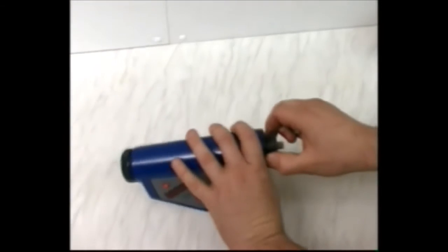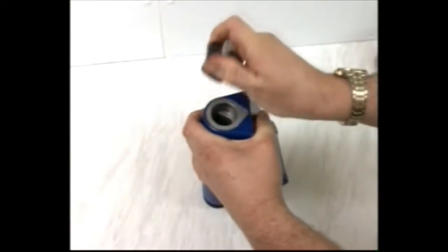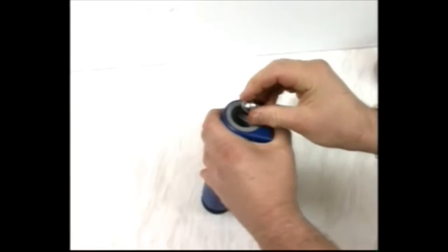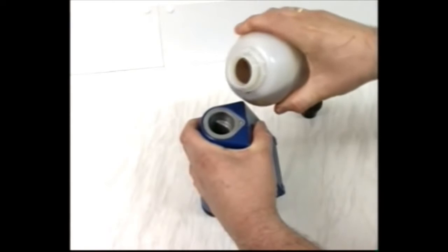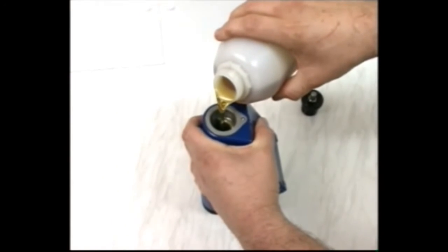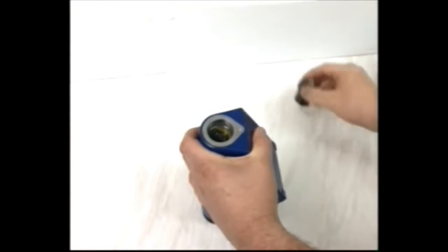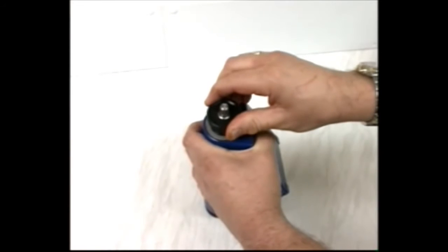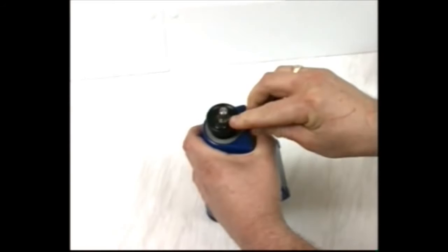To fill, hold the viscometer on its end, loosen the valve, and remove the plug from the tube. Make sure the tube is clear and clean and contains the metal ball. Fill it with the oil sample to just above the V plate. With the valve still open, push the plug in gently until any remaining air is gone, then tighten the valve and wipe away any excess oil.